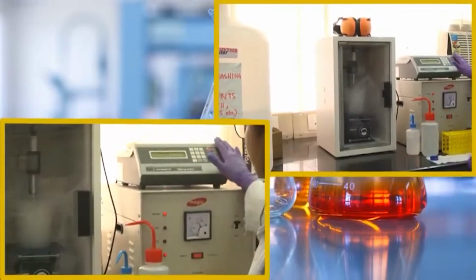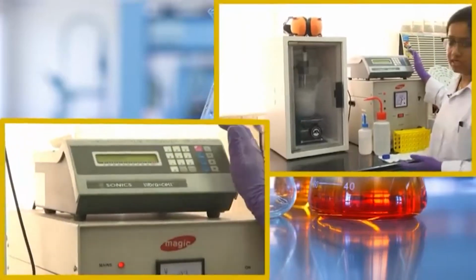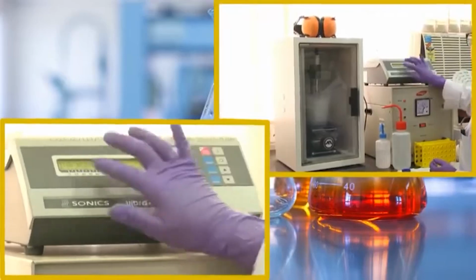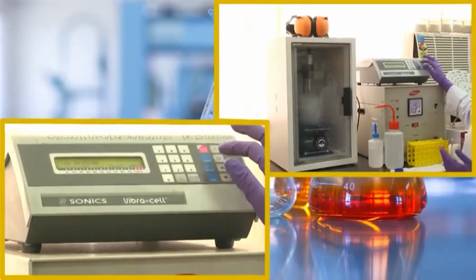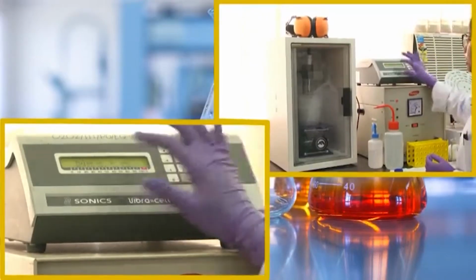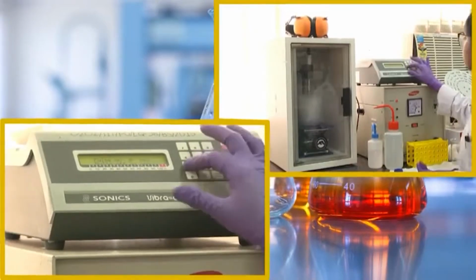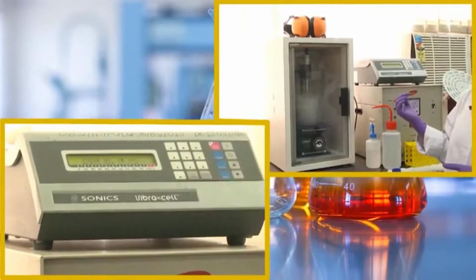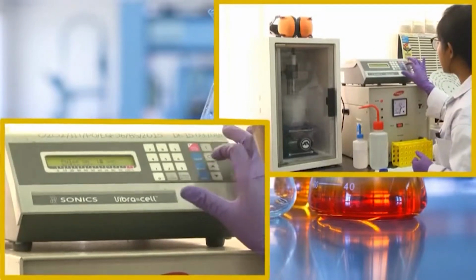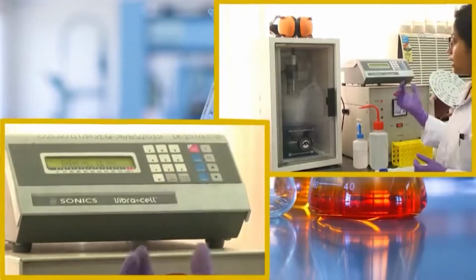Now we will come back to this particular instrument. This generates the pulses, and you can also modify the settings here. There are times, meaning how long you want to sonicate your sample. There is also pulse, which means the pulse on and off. Basically, what we usually do is go for 15 seconds of pulse. Whatever sonication or vibration it generates will be on for 15 seconds. Then we give a lag period of again around 15 seconds. During this lag period the pulse will be off.